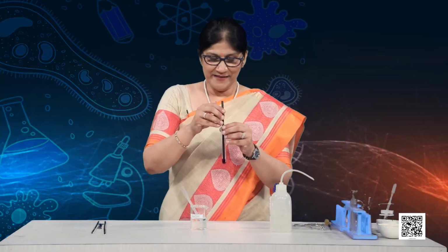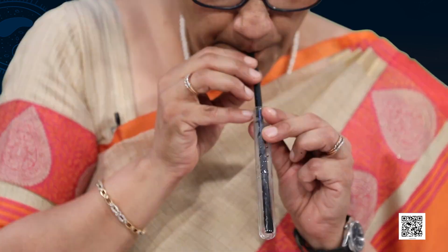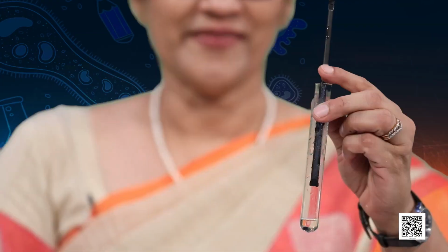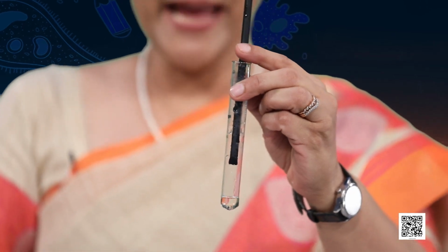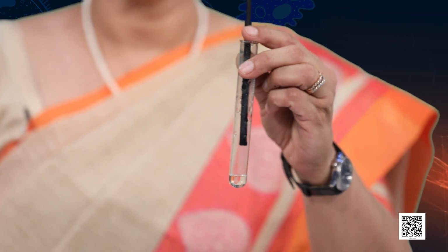Take a deep breath and again. Beautiful. The pink color has got decolorized. That means a base reacts with a non-metallic oxide to again give us a neutralization reaction.